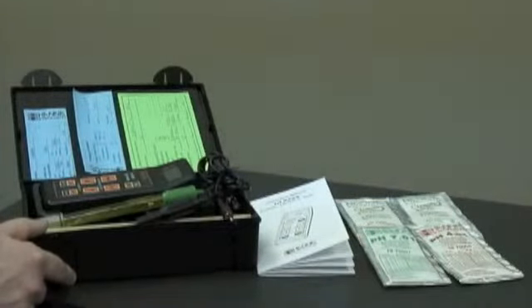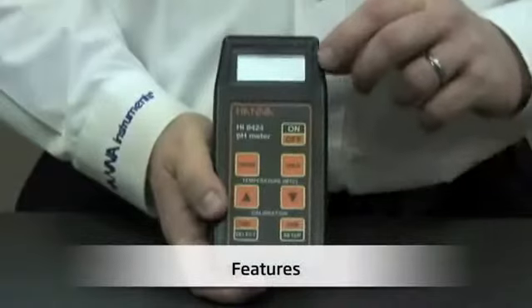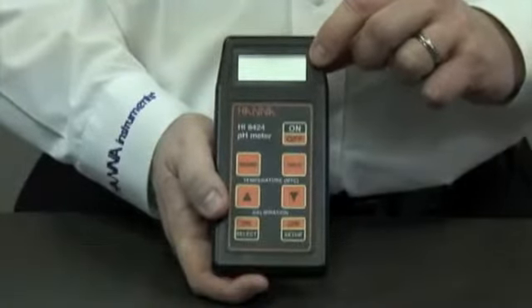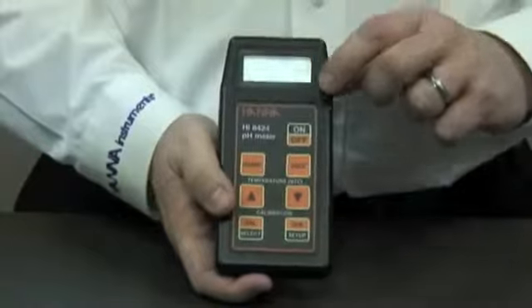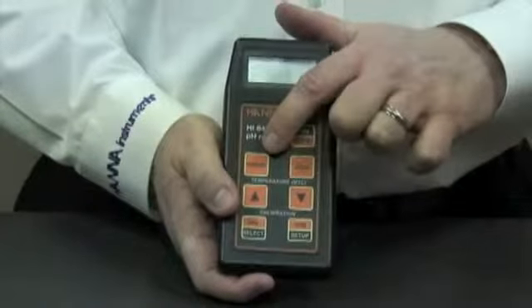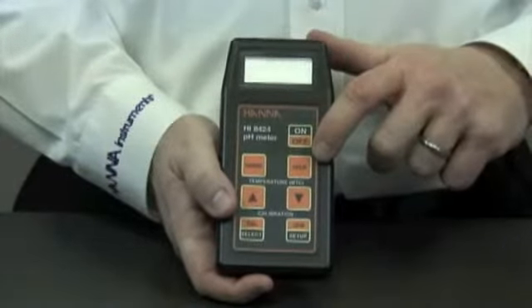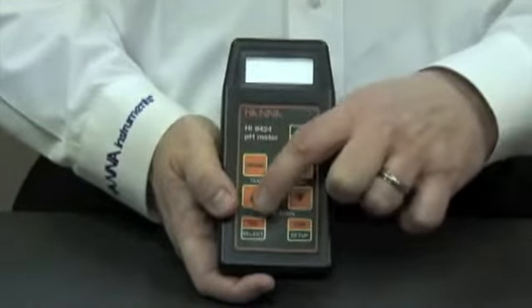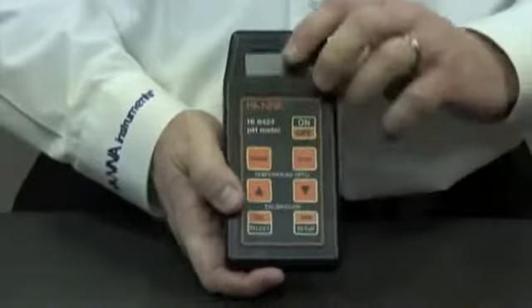Now I'd like to show you some features of the unit. Here we have the LCD display, which shows pH, millivolt, and temperature in either Celsius or Fahrenheit, the on-off button, the range button, the hold button to hold the readings, temperature buttons for manual temperature compensation, calibration button, and setup button.